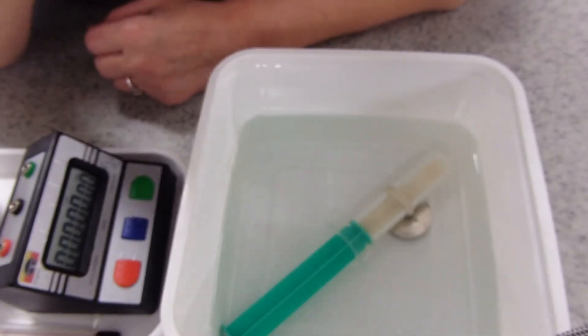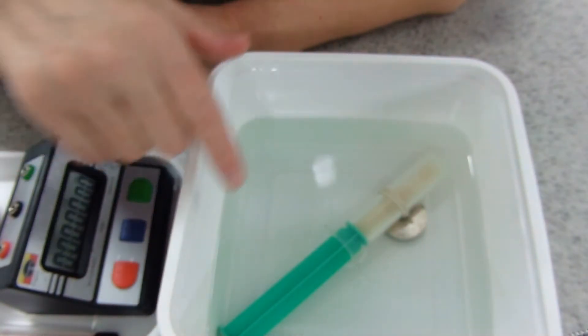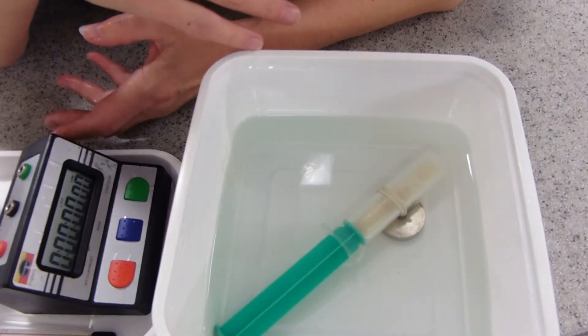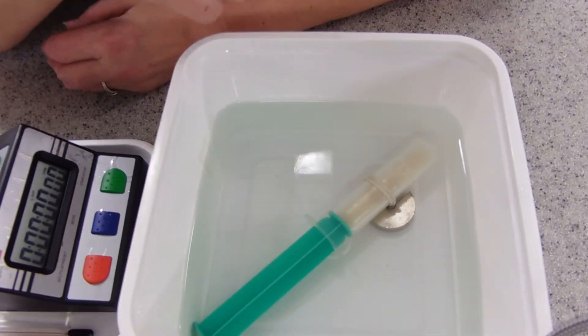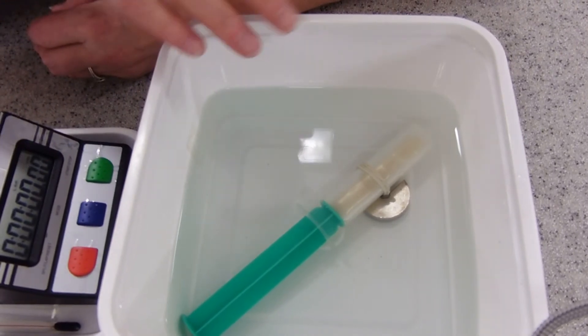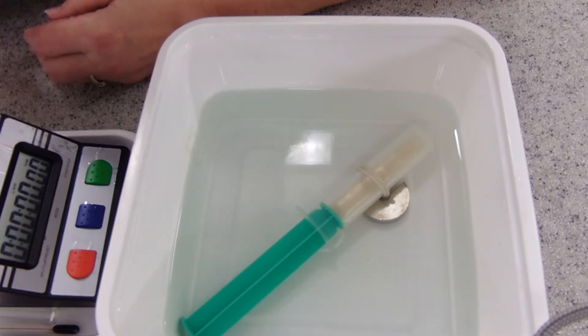We're going to leave it a couple of minutes just to equilibrate. Equilibration means that everything gets to the same temperature — all the equipment, all of the yeast cells. When they're equilibrated, the yeast cells will be bubbling at a constant rate, so the bubbles will be coming out fairly constantly. We know that it's not expansion of gases or anything else affecting it, just the temperature.